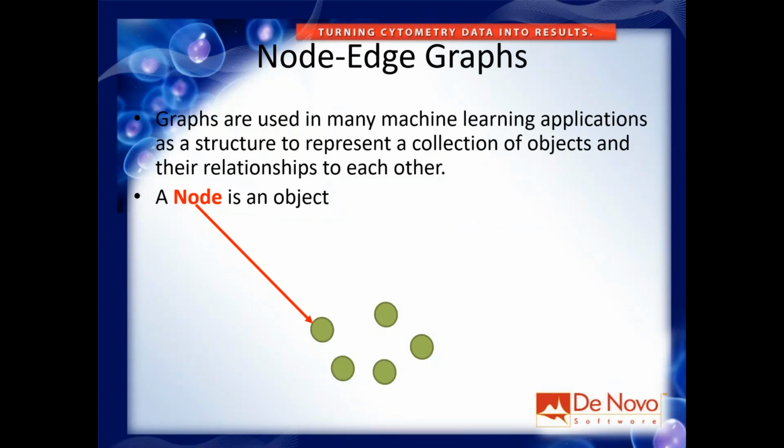Okay, and so I think I'm going to wrap it up there and maybe do a second part of this for those who want, down the road, where I'll talk a little bit about SPADE and other ways to represent these clusters, and how SPADE in particular uses these clusters to manipulate them and also represent them in a way that's biologically meaningful.